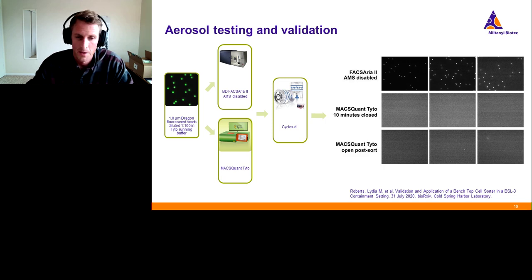But the point that I like to point out is that really in testing on the Tyto in a 10 minutes placed inside of the actual device, we see absolutely zero beads being captured. And this was tested across the entire cover slip. Obviously, there's just representative images here, but the entire cover slip was checked on the Tyto ones, and it did not show aerosols. So I think this is as good a proof as any. I'm convinced by this data.